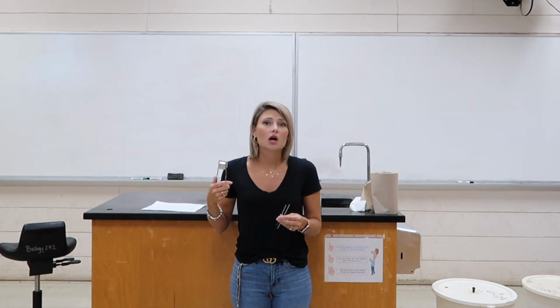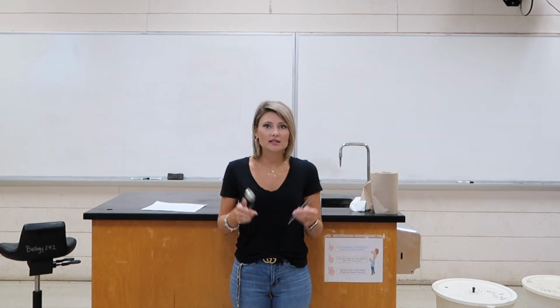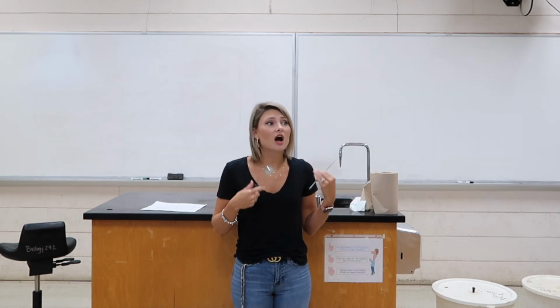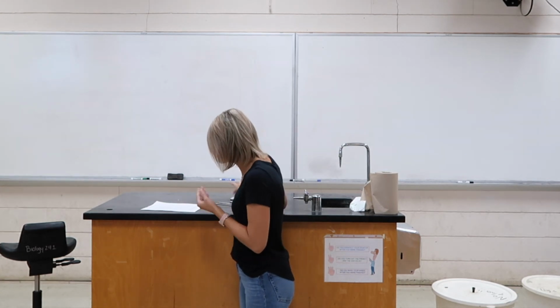Okay? So this is an added step that we're having to do to make sure that we sanitize everything between each lab. So whatever tools are going to be laid out on the mat, you're going to need to spray with the alcohol bottle to disinfect those before you leave. And then of course, you're going to want to wash your hands before you leave. We have hospital grade soap. We have 2 sinks in the back. So after you're done disinfecting everything that you've used, the very last thing you're going to do before you leave out of here is going to be to wash your hands with soap and water. Okay? So that's going to be how that is. So the answer to 21 will be disinfect your workstation before and after, and then wash your hands.